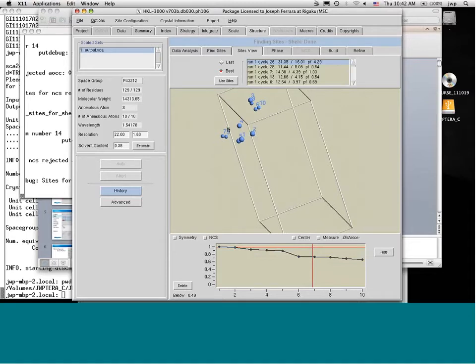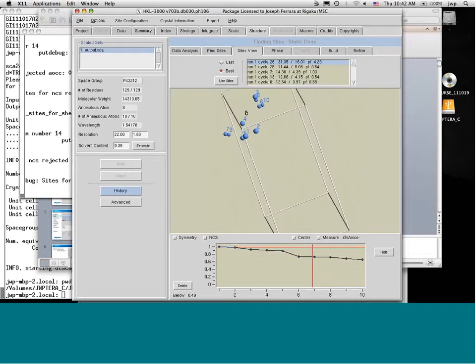these two atoms are close together, these two atoms are close together, these two are close, and these two are close. I can't tell the distance, but my hypothesis is that this distance is about 2 angstrom, which is what a disulfide is. And these guys are probably methionines.